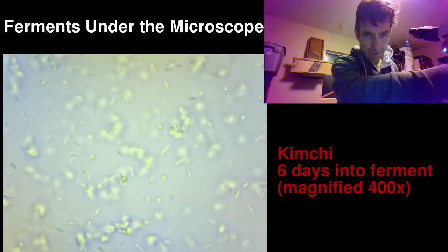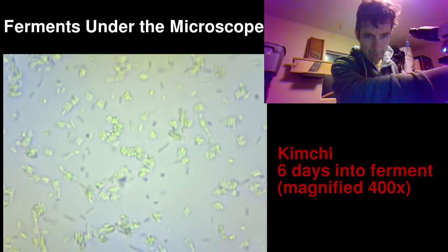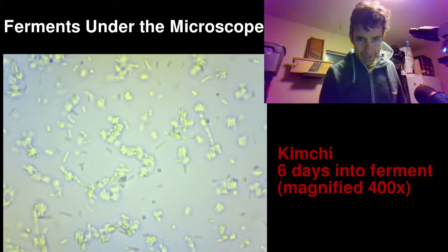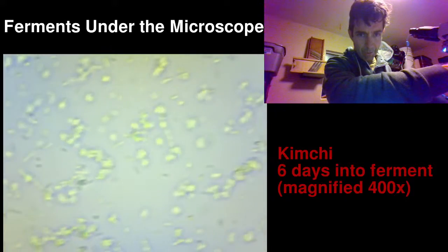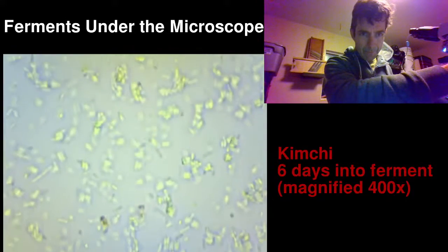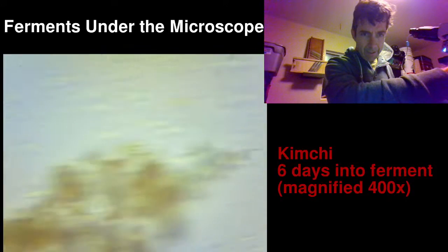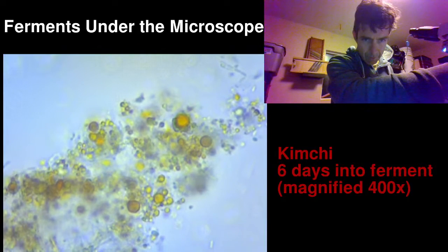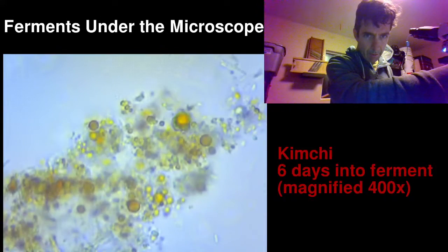I've got loads of different ferments we can look at under the microscope if this works. You can kind of see them hanging out, doing their thing, fermenting the food. Some are in little chains, some are just on their own — they're doing their thing. As I learn more I'll guide us through this microbial world. Here's another little bit of plant matter.